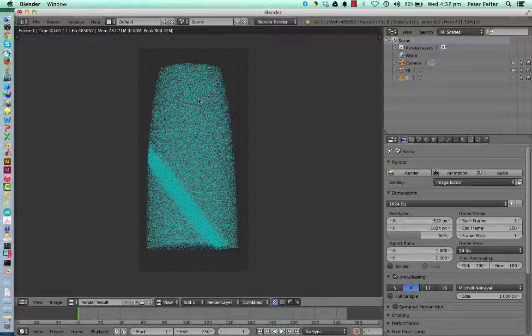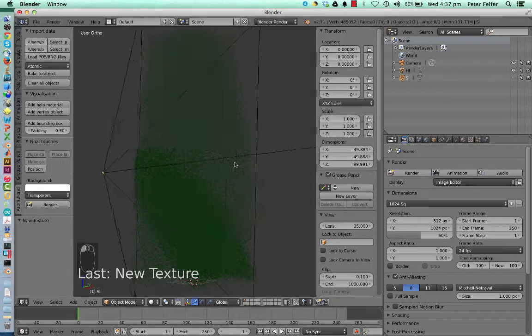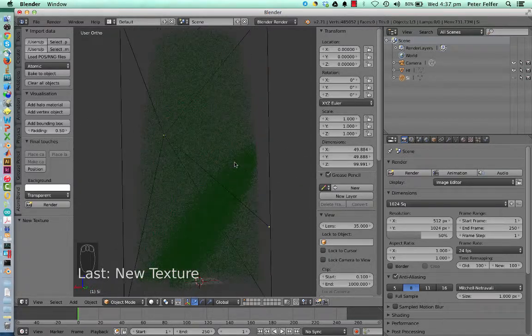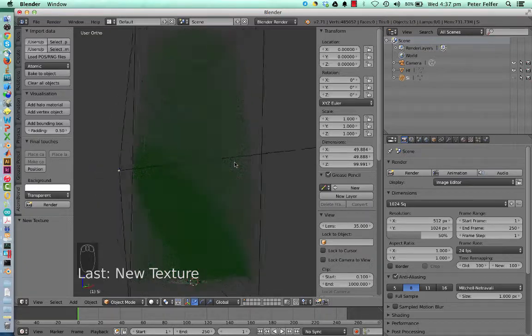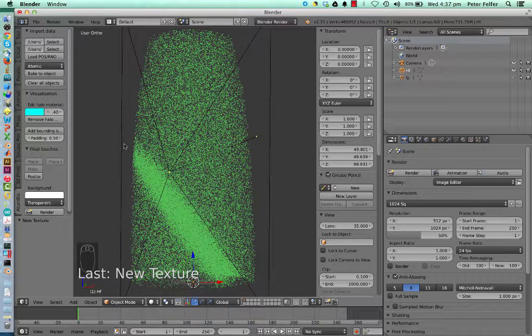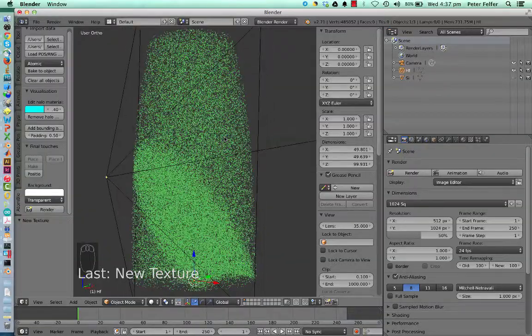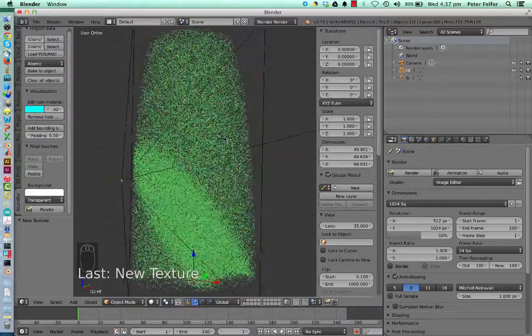In order to do the other type of visualization, which is using spheres, there is vertex duplication. Again, we've got everything automated for you, and I'll show you the automated version, and then I'll show you the manual version. And as far as combining the two, actually you can have both at the same time, and I'll show you an easy way to switch between one and the other. So I'll go again into the 3D view of the hafnium.